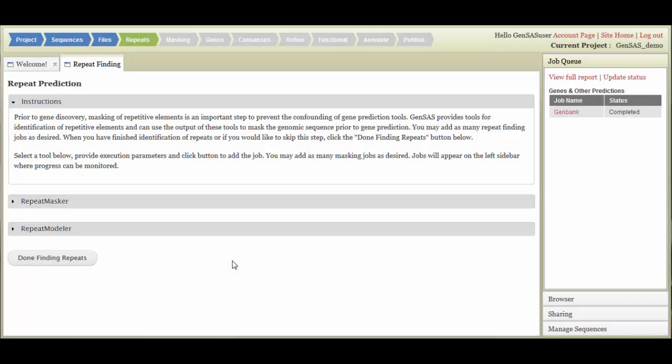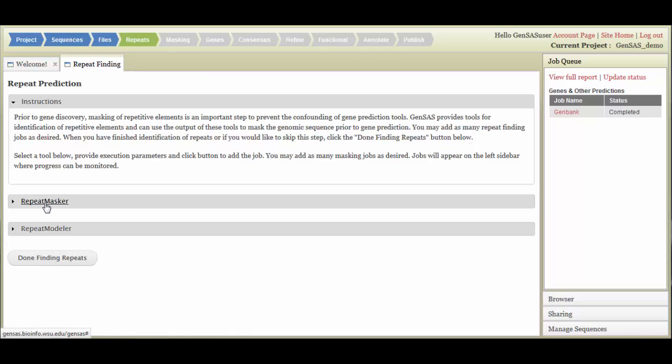In the Repeats step, you can use two programs to find repetitive elements in your sequence. Repeat finding is essential for accurate gene finding in eukaryotes. If you are annotating prokaryote or viral sequences, you can skip this step by clicking the Done Finding Repeats button. The two available tools are Repeat Masker, which uses species-specific evidence to identify repeats, or Repeat Modeler, which is a de novo repeat finder.